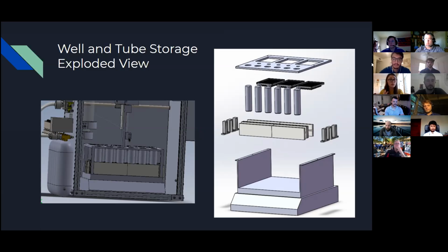The rack has 2 rows of tubes that are sandwiched between breadboards that are fastened to the shaker. The breadboards have 650 and 470 nanometer LEDs on one side and the photodiodes on the other. The LEDs will shine light through the width of the test tube, and the photodiode will read how much light is transmitted through or emitted by the cultures. The photodiode measurements will be translated into optical density and fluorescent intensity readings.